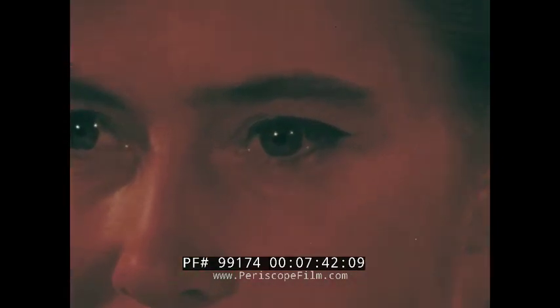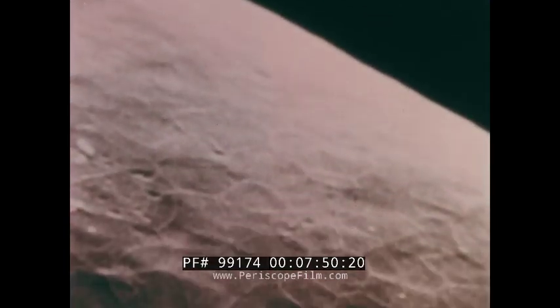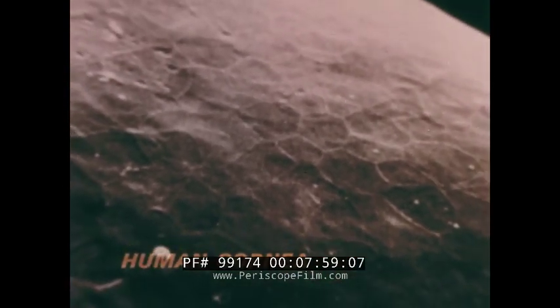The eye is a window from which we view the passing world. Suppose we turn our instruments around and examine this marvelous organ. At first sight, it looks like an unknown planet. But we are looking at inner space, the epithelial cells of the human cornea.